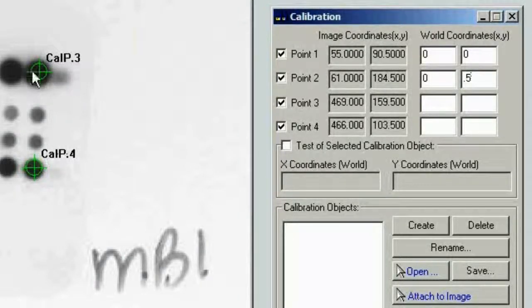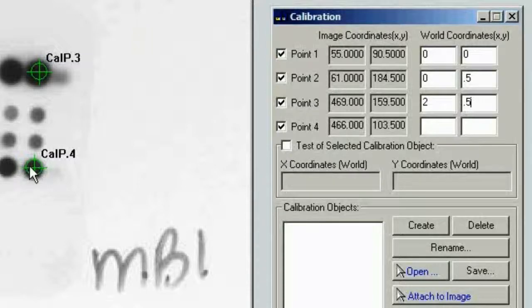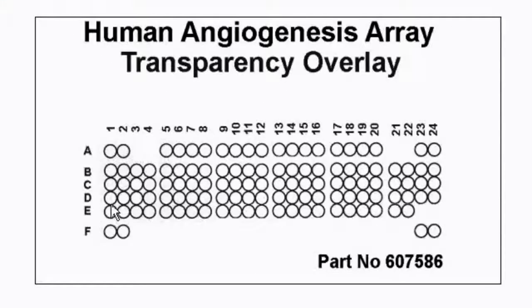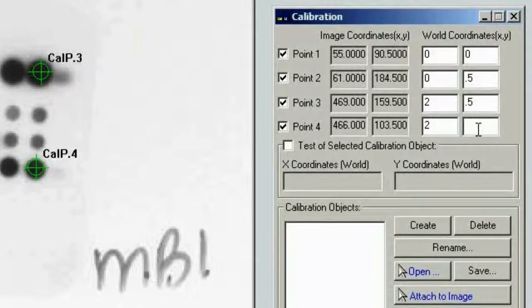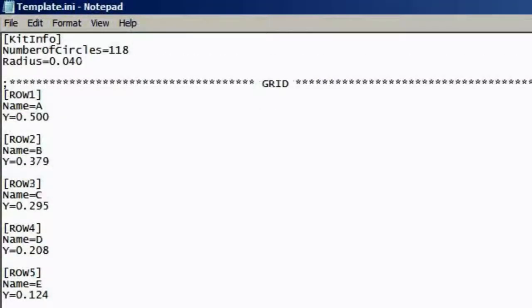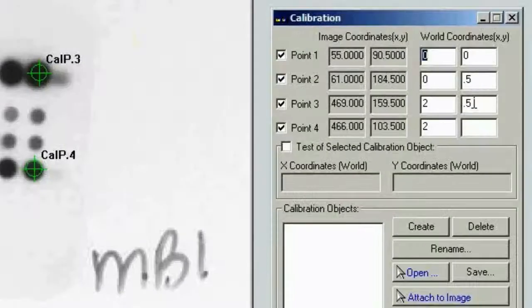For point 3, we know from measuring the template that it is 2 in the X direction and 0.5 in the Y direction. For point 4, we select the lowest-right known point — according to our template that would be D24. We look at the template.ini file to find the Y direction value: row D is 0.208. So we enter 2 for X and 0.208 for Y.